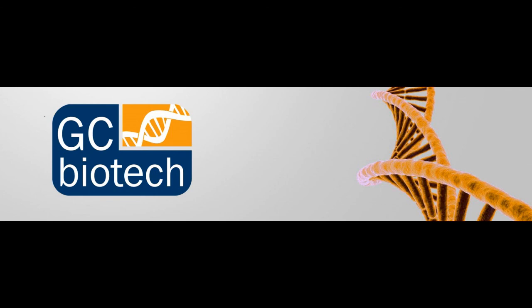So the spectral deconvolution that you sometimes see in the market, we've looked into that significantly over the years, and our feeling on that is really it's kind of a black box implementation, and the quantities of contaminant required to trigger that spectral analysis and contamination correction is really too large to be useful in a practical setting.